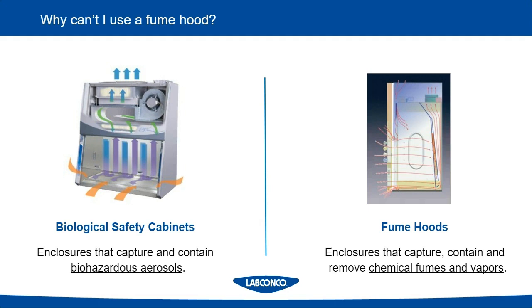And the reason that we have these two very different types of hoods is that you never would want to handle a virus or a particulate or something like that in a fume hood, because fume hoods don't have any type of filtration built into them. They typically carry all the fumes and vapors right out an exhaust stack into the environment. We do not want to do this with biohazards. You always want to make sure biohazards are trapped in some kind of HEPA filtered enclosure. And that's the kind of thing we can get from a biosafety cabinet. So we'll talk more about biosafety cabinets later in the presentation.